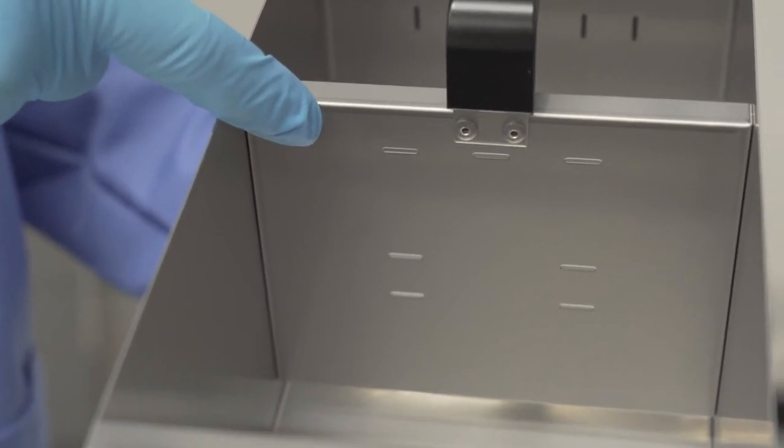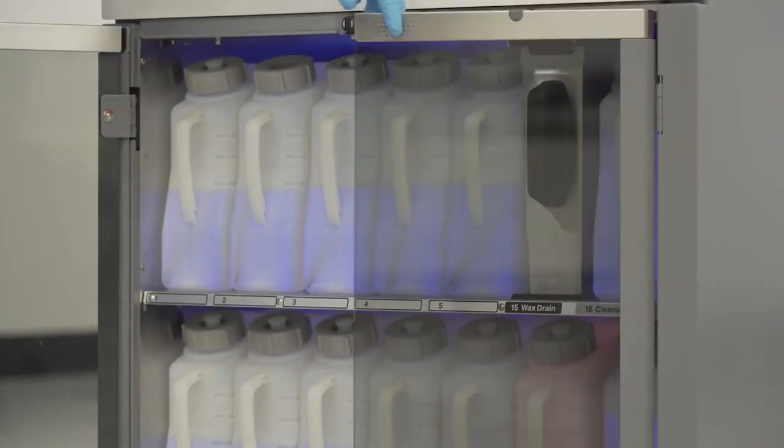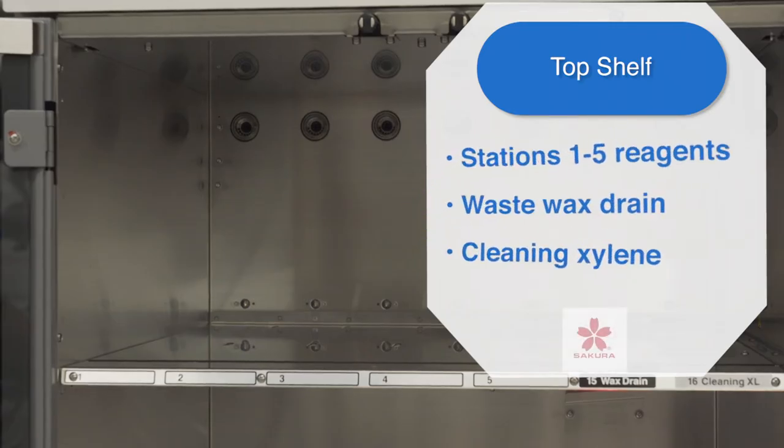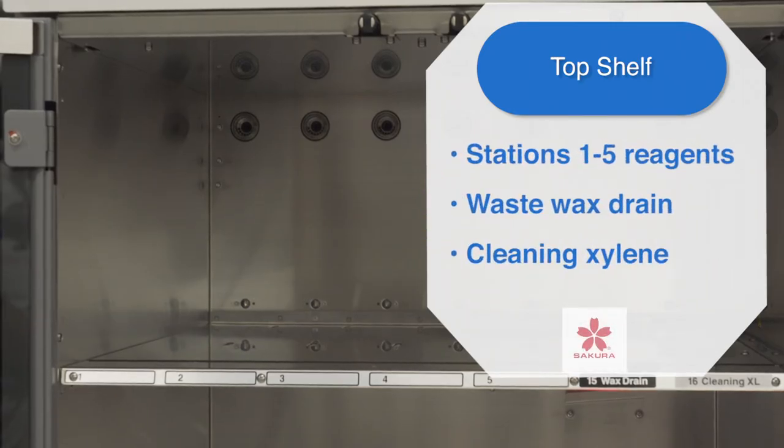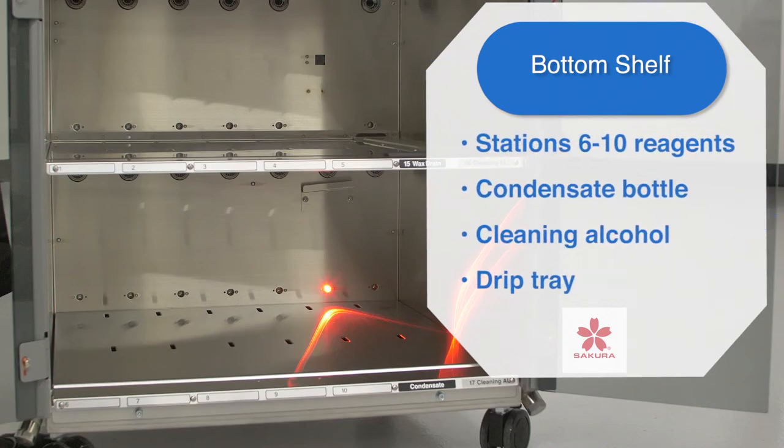The lower section of reagent module consists of 13 plastic containers and one metal wax drain. Ten containers are used for your processing reagents, stations one to ten. There are two shelves in the reagent module. The top shelf holds stations one through five processing reagents plus the waste wax drain and cleaning xylene. The bottom shelf holds stations six through ten processing reagents.